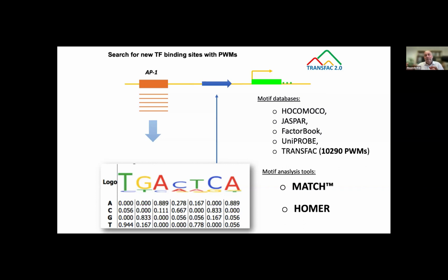It's a kind of experiment of building a matrix for one cofactor, which by itself doesn't have its own DNA binding domain; it binds DNA through other factors. But generally, we are not doing it for other cofactors. For instance, another factor called retinoblastoma, RB, which cooperates with E2F and some other factors, doesn't have a DNA binding domain, and we don't have a matrix for that.